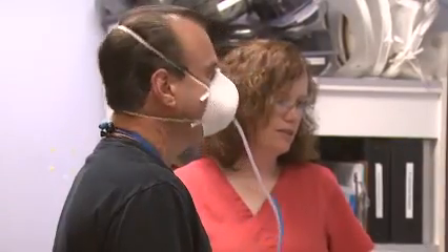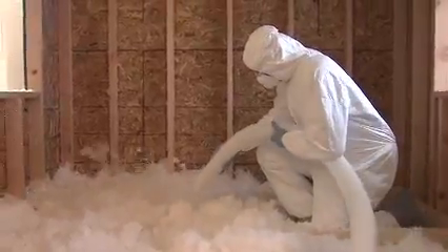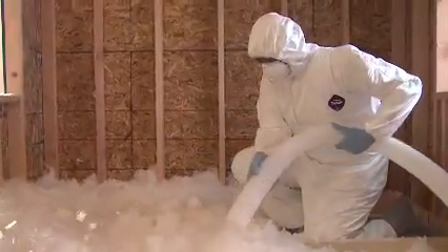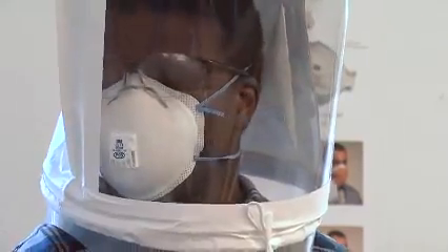Quantitative fit testing can be used for any type of tight-fitting respirator. Many workers need to wear prescription glasses or personal protective equipment, such as safety goggles or earmuffs, while performing a job. If you fall into this category, then you must wear these items during the fit test to be sure they don't interfere with the respirator's fit.